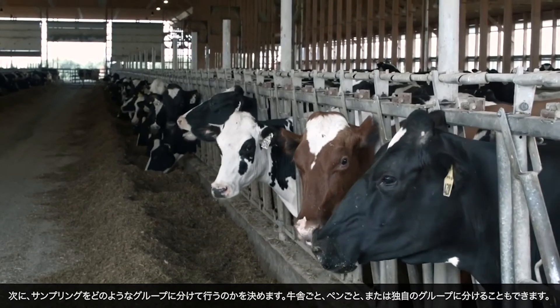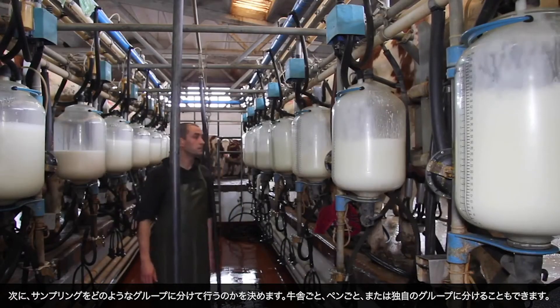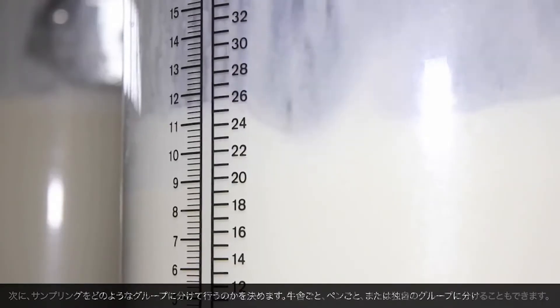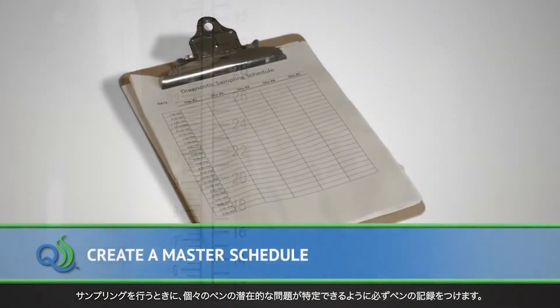Next, establish a testing scheme either by barn, pen, or an original planning system that will identify specific groups to be tested. Be sure to log a pen inventory at the time of sampling so you can identify potential problems within individual pens.